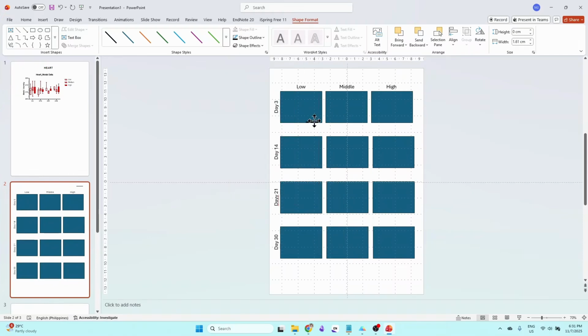Yeah, and just place it manually. Of course, you would have to use a photo of the scale bar, and then make sure that the photo of your scale bar and, for example, your actual image photo, just align their lengths. Okay. And then once you align their lengths, you will base the scale bar on the scale bar photo. Okay.